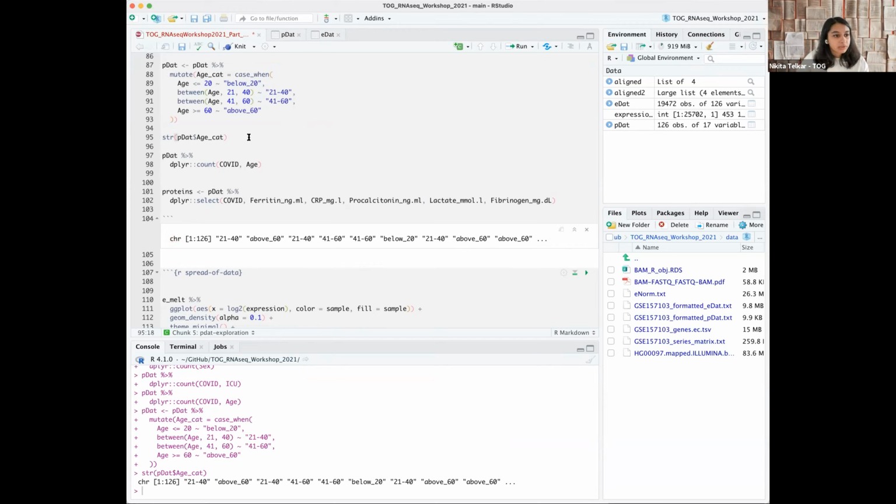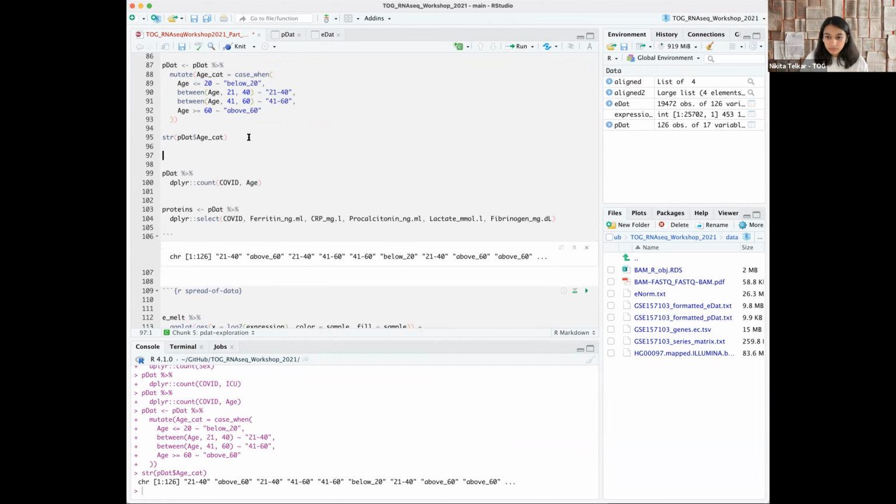So I am going to convert that. So Pdot$H as a factor. Just do that.